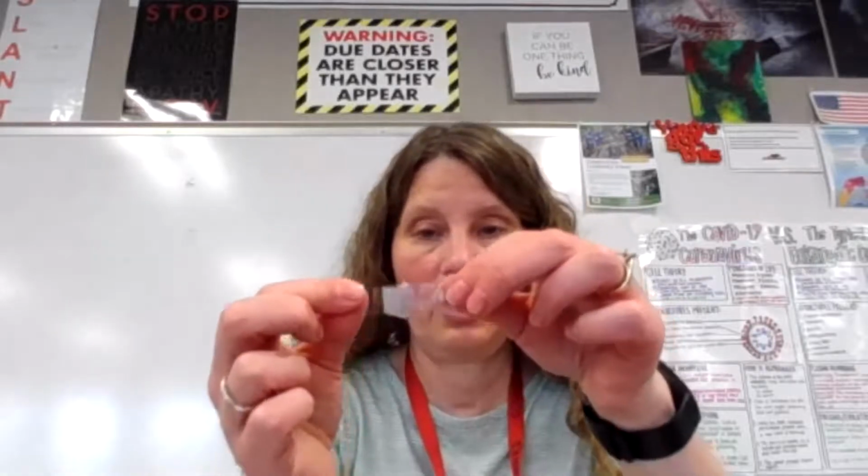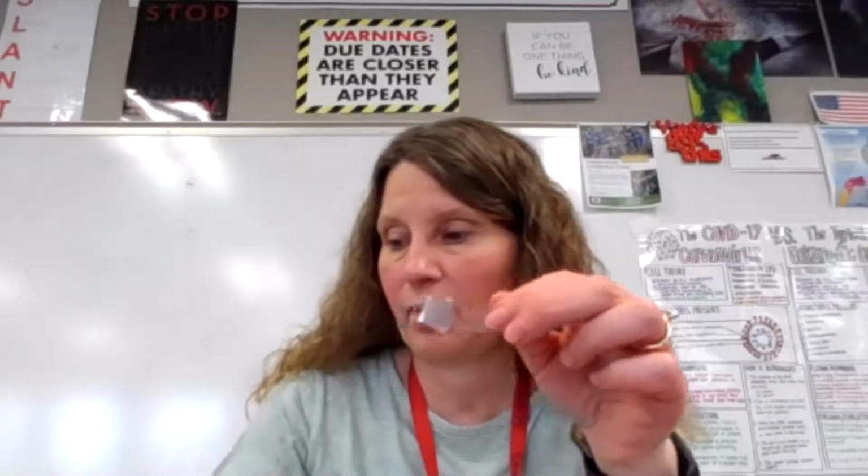And as you can see, the fingernail polish came off with it. You can also possibly see my fingerprints there that you don't want to look at under the microscope. Then you're going to get a brand new slide. And the slides you want to be very careful that you just handle the edge of. So again, that you don't put fingerprints on this because fingerprints will make the stomata a little bit more challenging to count. So you're going to very carefully lay this down and do your best to not get wrinkles on it, to get it as flat as possible.